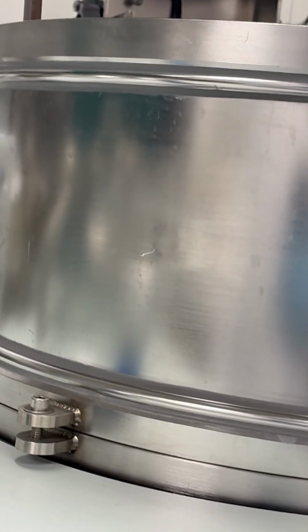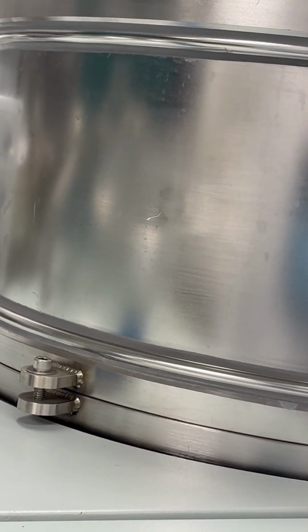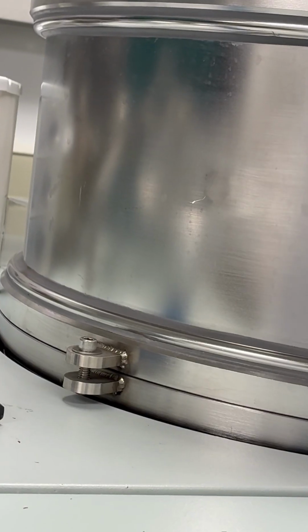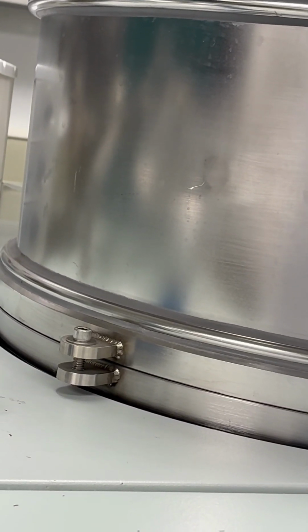because our samples are right here when the metal gets deposited on them. And if you notice, it's got a rotation, a curvature to it. That's so that everything is all about the same distance from the source, right? And so if I was just to take that QCM, take it for its word, it's gonna say, oh, I'm growing 4 nanometers a second, right? But that's where it's growing here.